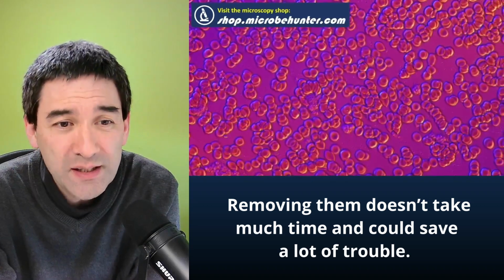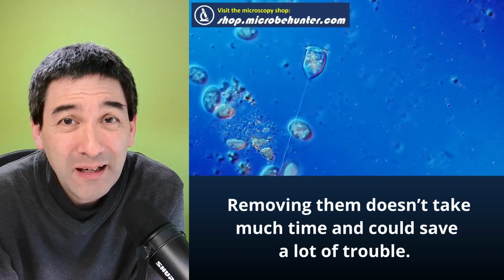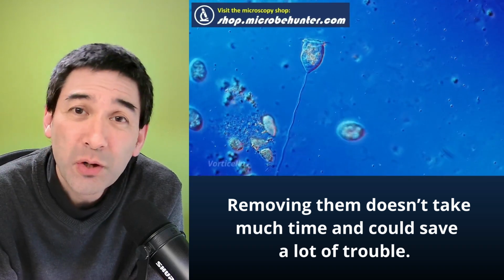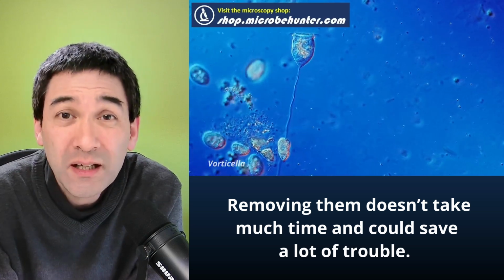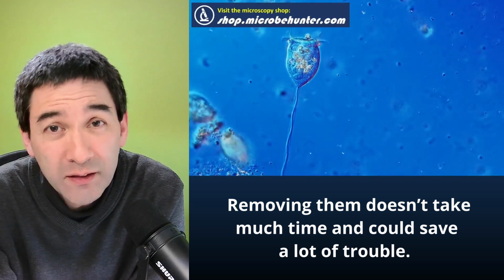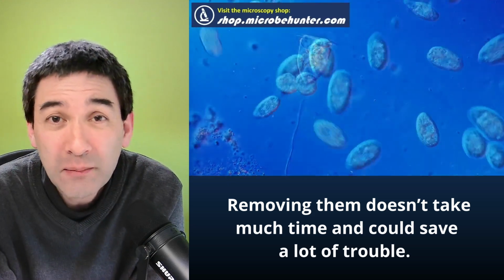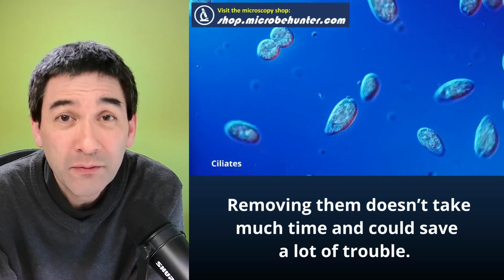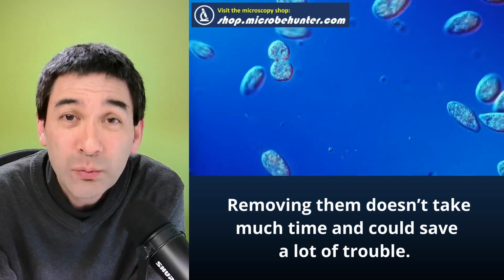So the question is why don't you just remove those? Well, this is not practical. The reason is that I need the lower magnification objectives to find the focus. I need to start with a 4 times objective and then focus it, center the slide, work my way up, and only after I've used the 40 times objective do I switch over to the 100 times oil immersion objective, and only then will I add immersion oil.